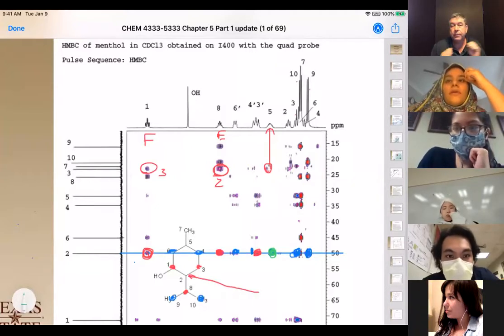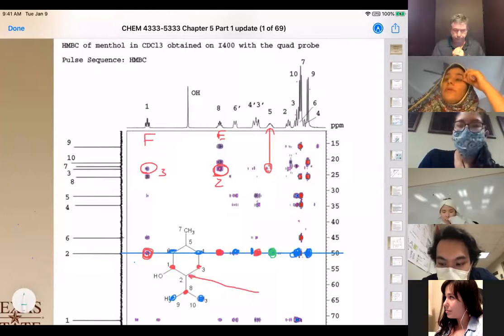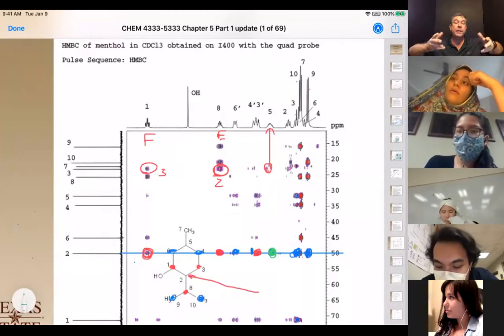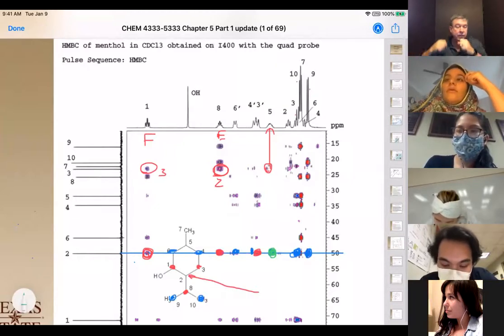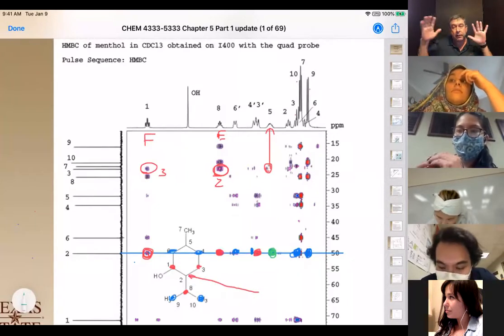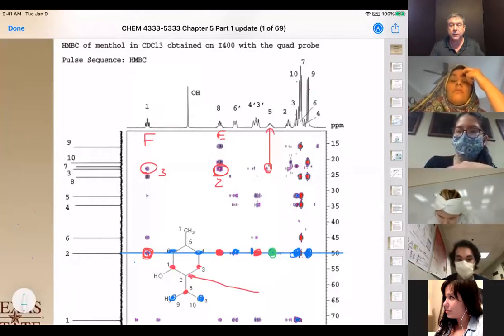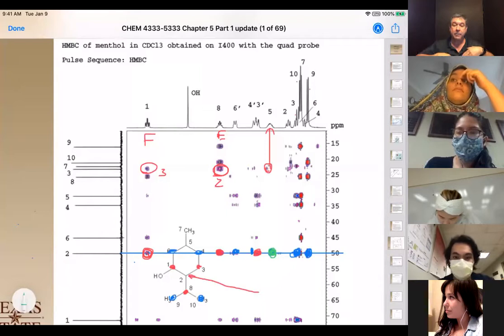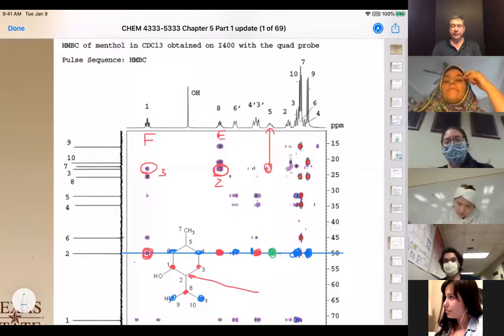So this spectrum, you can only use this when you know the structure of the compound. If we don't know the structure of the compound, then, okay, I have the structure on so we can see where things are as we go through it. That is the thing I'll talk about next time. It's called the accounting method, where we try to figure out what's going on. By creating a little table of, this is connected to this and this is connected to that, we'll be able to divine the structure with just these spectra. So it's going to be harder to get the structure out instead of showing you where the peaks should be. So I've done it this way first. We're going to go the other way next.